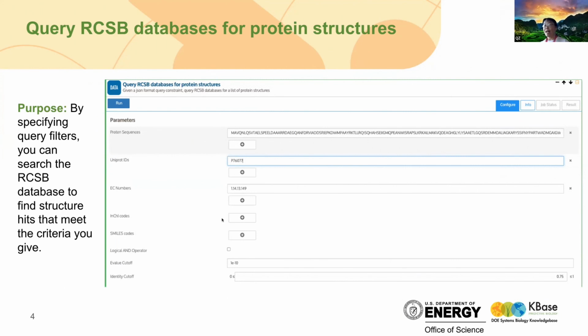But what I have currently installed is you can search by protein sequence, by UniProt ID, EC number, and you can use chemical InChI code, SMILES code, and maybe some more. Notice here you can add multiple search criteria. Each one could be prefixed with a logic AND or OR, but it's built in.